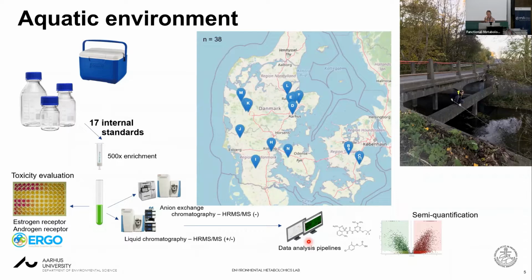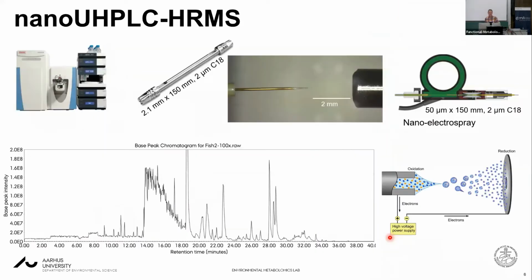Then we do the data analysis, and we did some semi-quantification I can come back to. So one of the platforms we are using is an LCMS. It's running with a nanoflow system. This is a conventional LC here, and these are the dimensions for the nanoflow system.